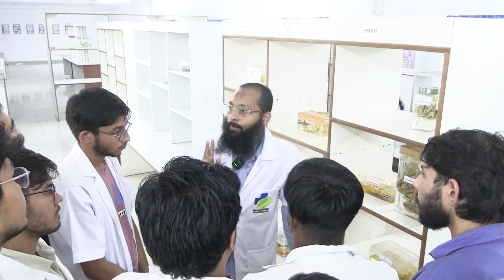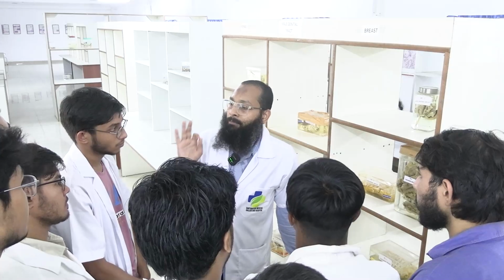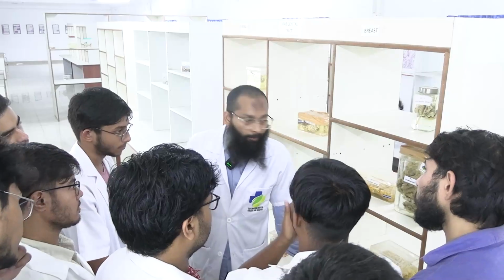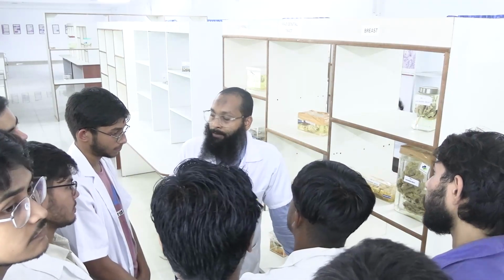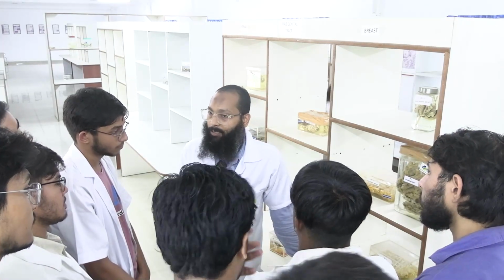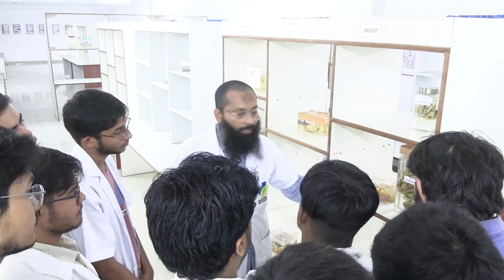First of all, there are many types of breast carcinoma. Without looking at the microscope, I can't say what kind of carcinoma, though that is the most common one. Maybe what you are saying could be correct, but how can you prove it? Unless you look at the microscopic slides, you can't say this is IBCNST. Okay, clear? So you have to describe in this way.